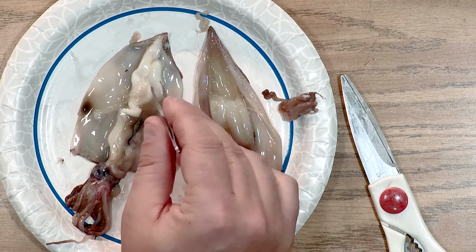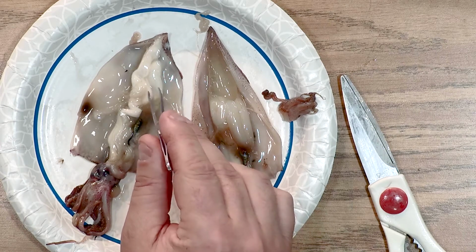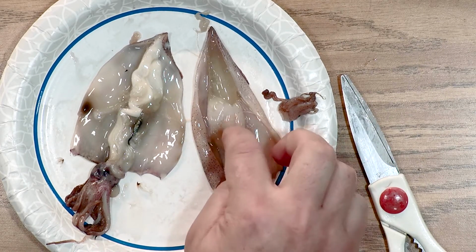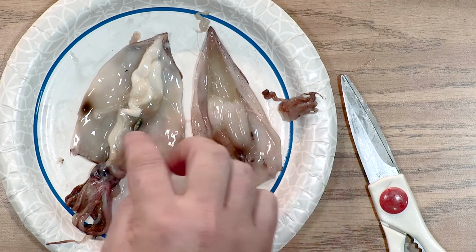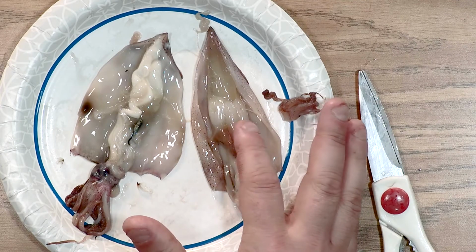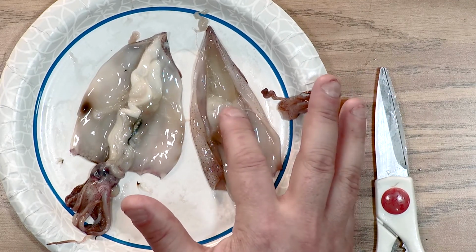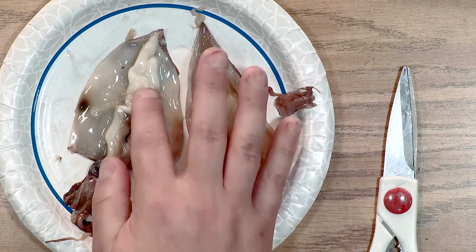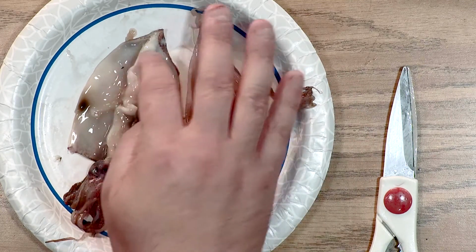Well, if you guessed that this was the male squid, you are correct, which leaves this to be the female squid. Notice it's got different organs here than we've got over here. And this is really something that you have to feel to understand. This has like some structure or strength to it, where there's way more squishiness going on here.